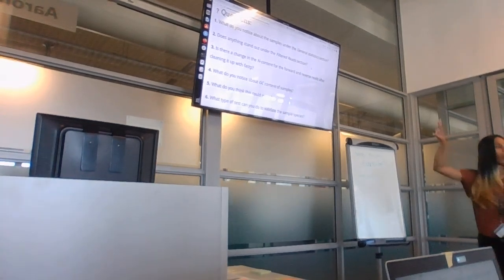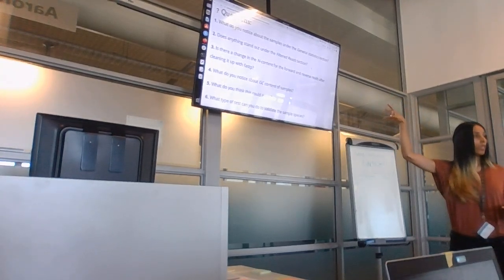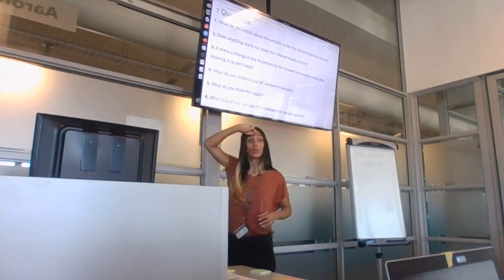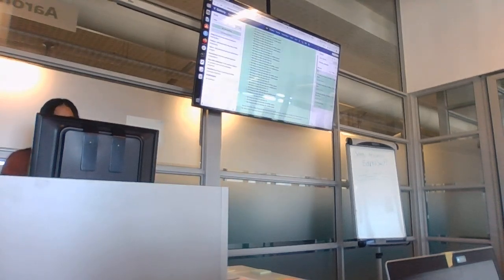Does anybody know how to do this part after you have your data? You've generated how many output files? How many new outputs? 3, okay? So I said already the JSON file is going to be used for the next step.